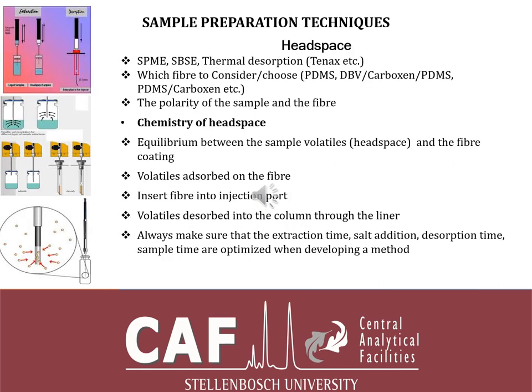Headspace is one of the widely used forms of sample prep techniques nowadays because of the potential that it possesses. Advantages: you can work with minute samples. If you don't have a lot of sample, you don't have to use a lot of solvents if you're doing direct SPME. And we'll talk also about some SPME techniques, like for instance fiber derivatization, and then SBSE.